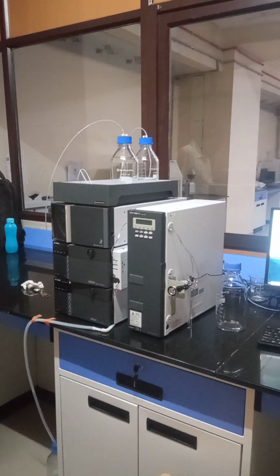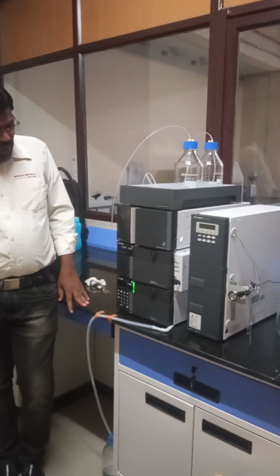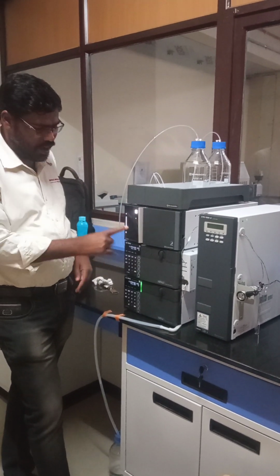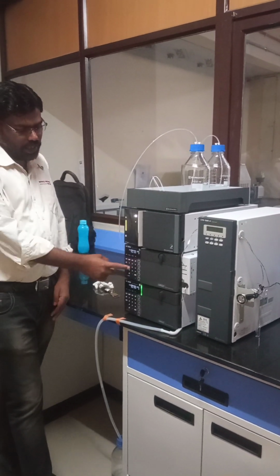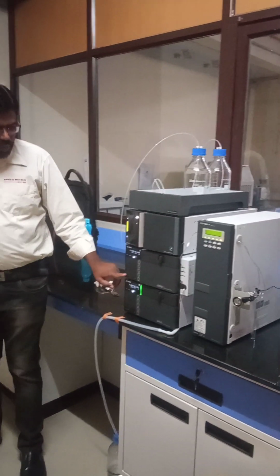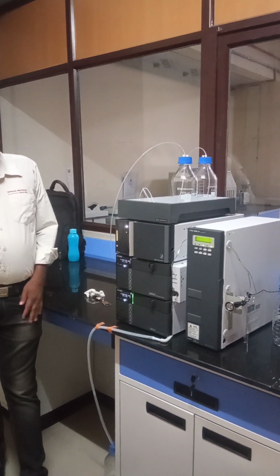Power on all four modules in this bracket. The detector is on the back side. This is the order we need to follow. Any direction is okay, but each module should be powered on. Only the detector has its power button on the back side; the remaining ones are all on the front. One, two, three, and this is the back side power button. Up to this is the power on.